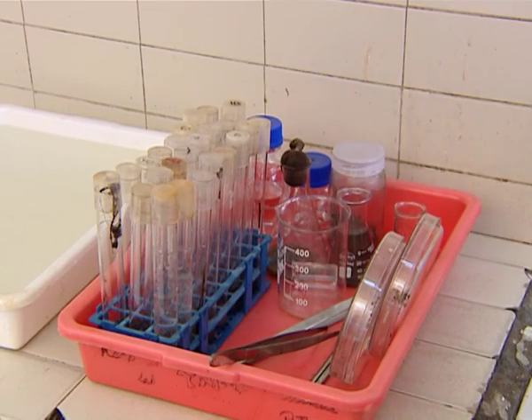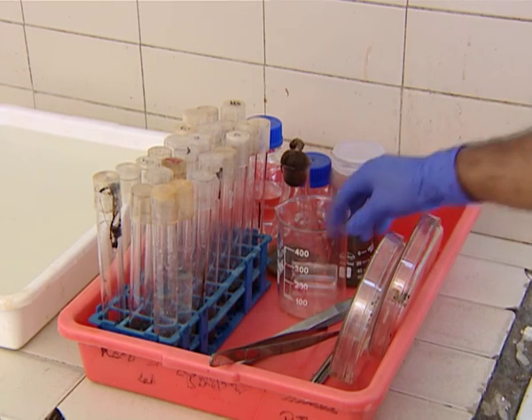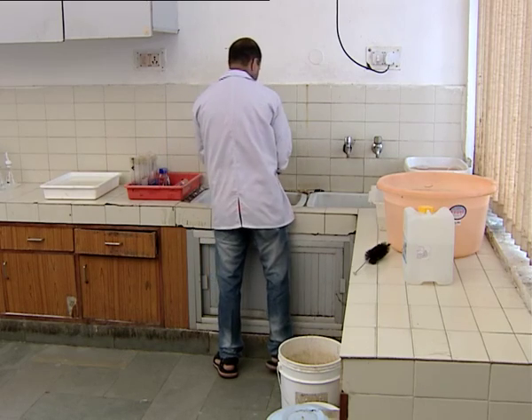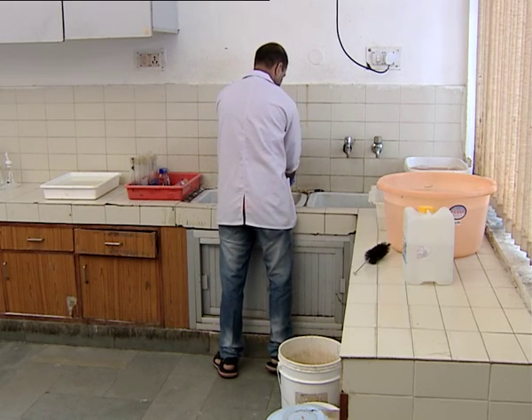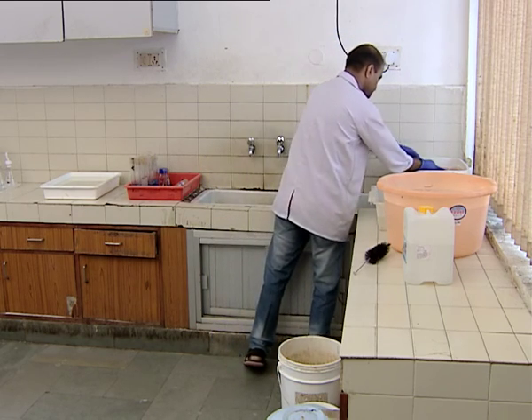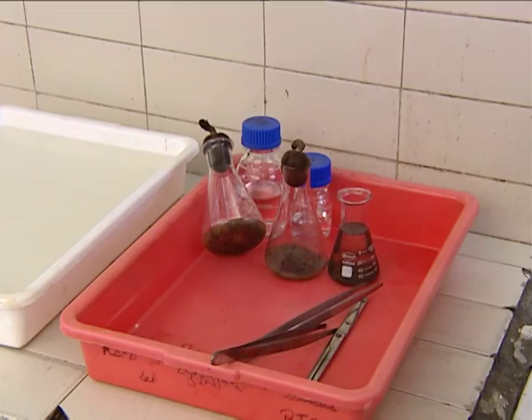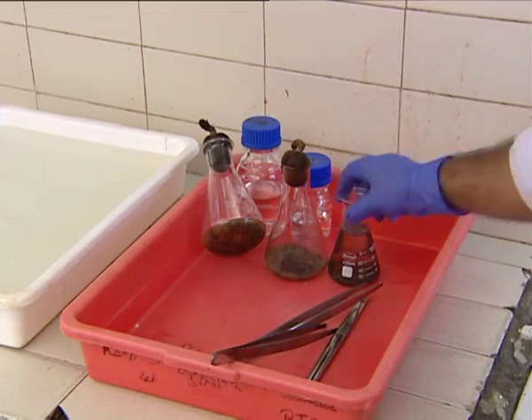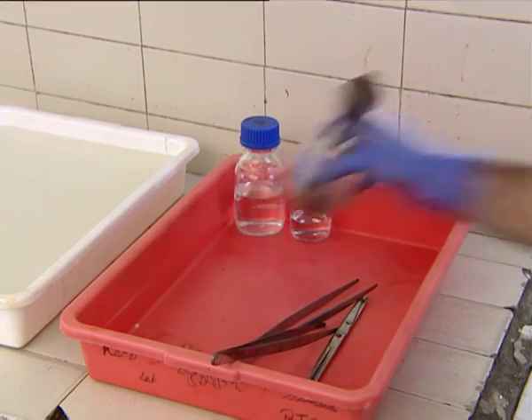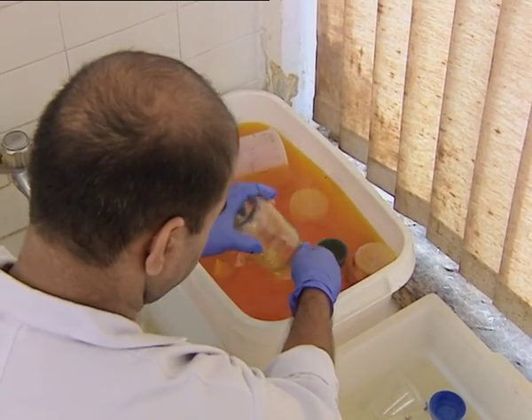Before performing plant tissue culture experiment, it is required to have clean and sterile culture vessels. Before using any glassware or plasticwares, these are first washed in a 4-step process. Firstly, all used glass and plasticwares with used cultures and media are autoclaved for about 1 hour. Then the glass and plasticwares are immersed in a tub full of chromic acid for 16 hours.